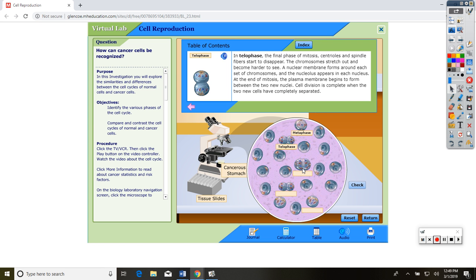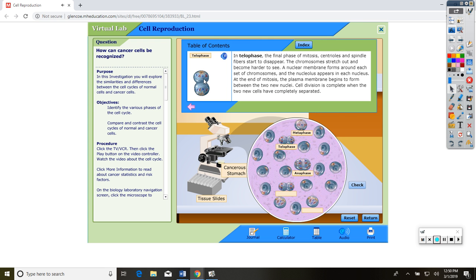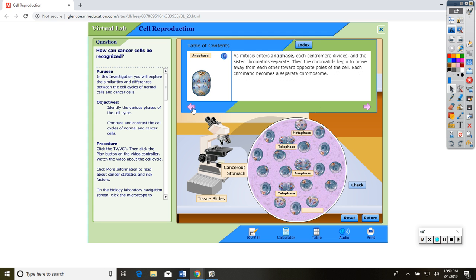This one here looks more like anaphase. I don't really see that indentation that I see in telophase. So I'm, again, clicking the label, dragging down to the box. Down here, I see that distinct indentation. I'm starting to reform that nucleus inside of there. So I would say that's telophase. And down here, this one looks like it's in prophase. I can clearly see those distinct chromosomes, and they're not lined up along the center.